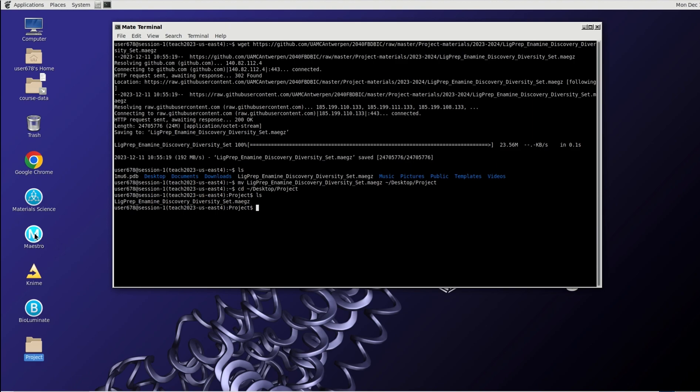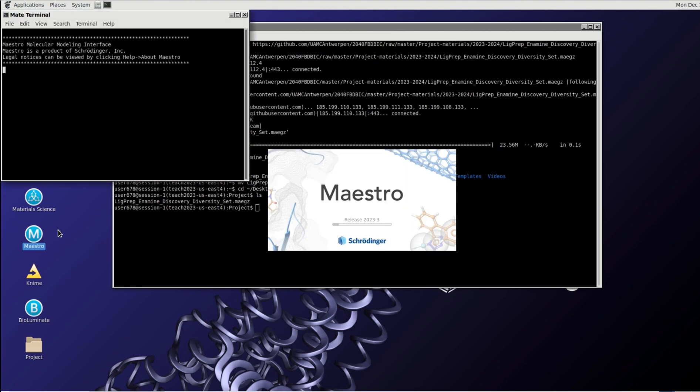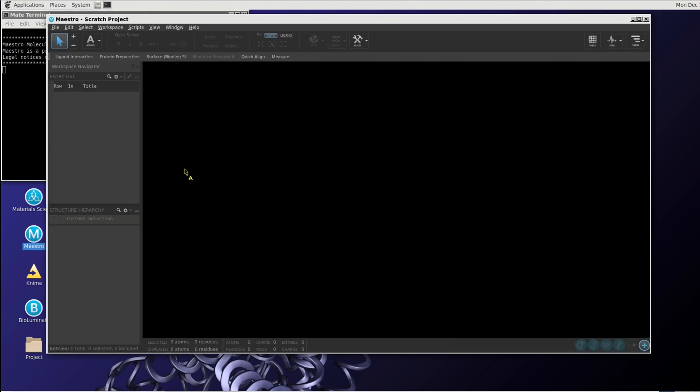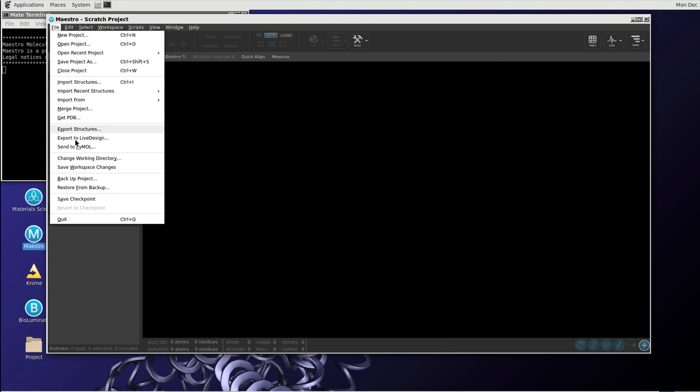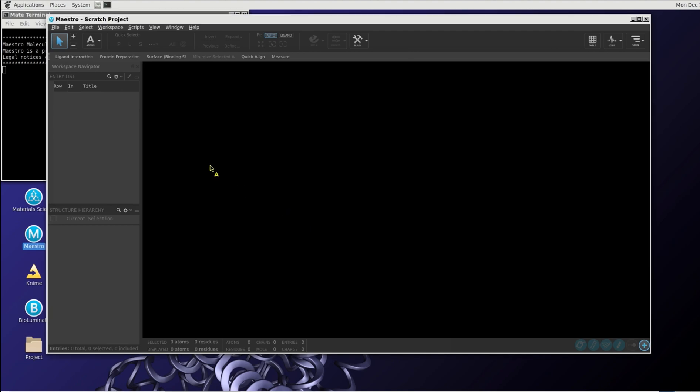Now it's time to start with the maestro. We click on maestro. Maestro will be opening. So it's version 2023-3. And the first thing we do is make sure that we can use this project folder to put everything in. So we will change the working directory first. Go to desktop, then projects. And we select this one as being the default folder in which we can write everything.